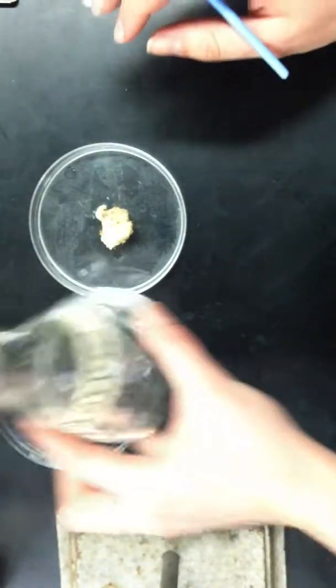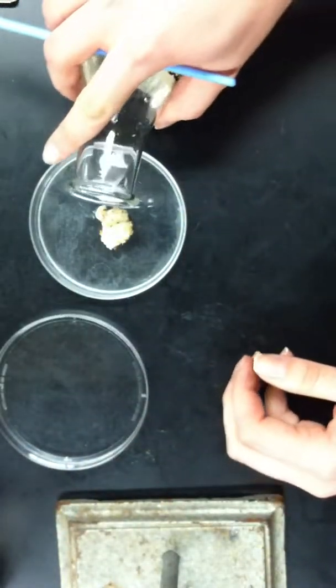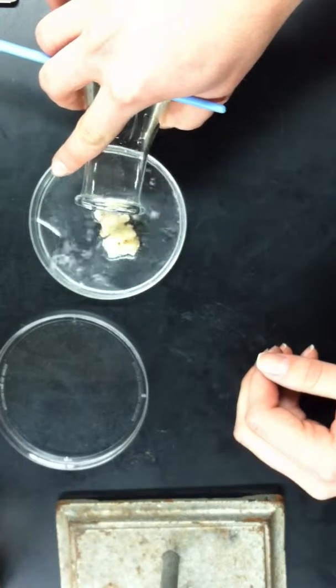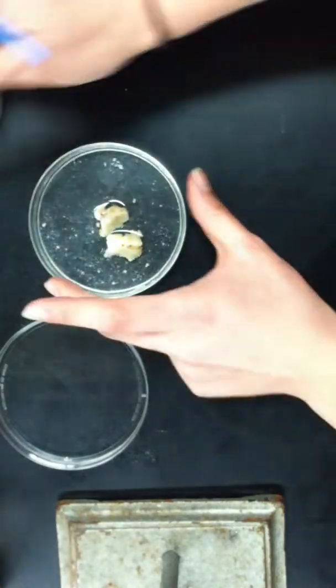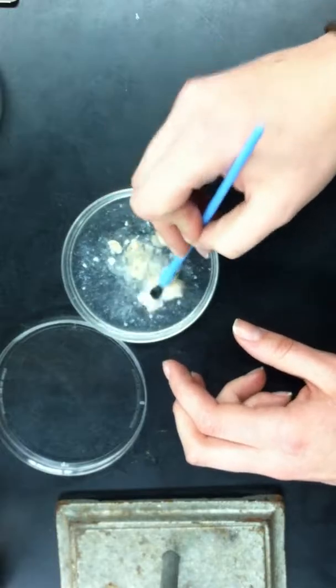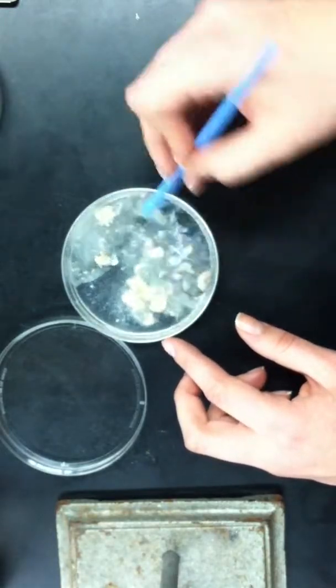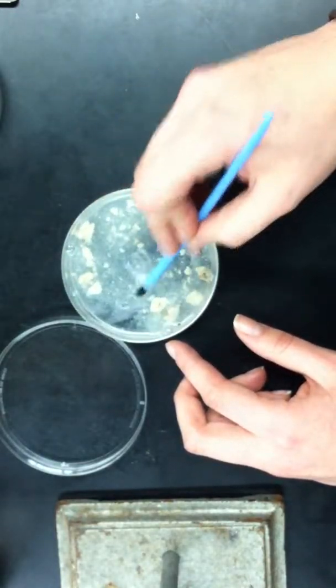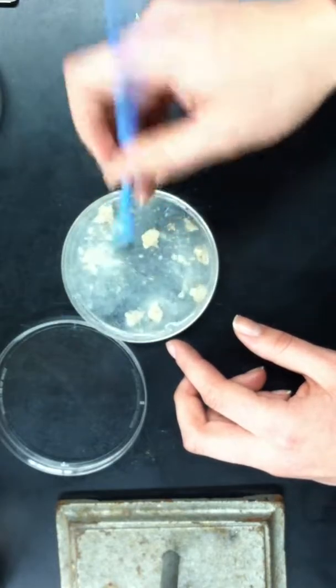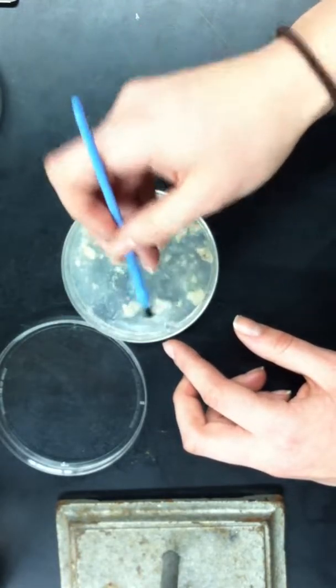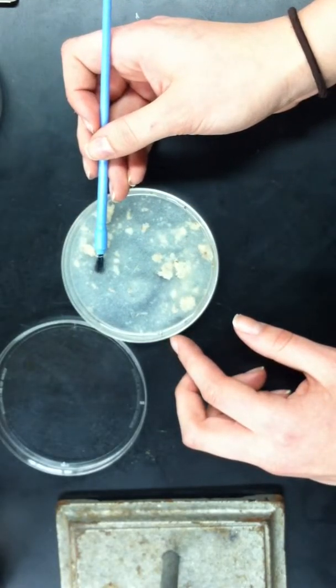Next, you're going to take the sucrose solution and pour however much you want or you think is necessary into the plate and kind of mash up the media so it dissolves inside of the sucrose solution. And the reason you're using a sucrose solution is because the larva begin to float to the top.